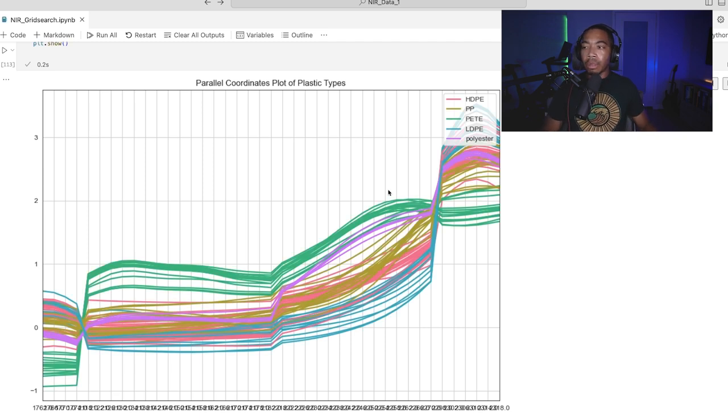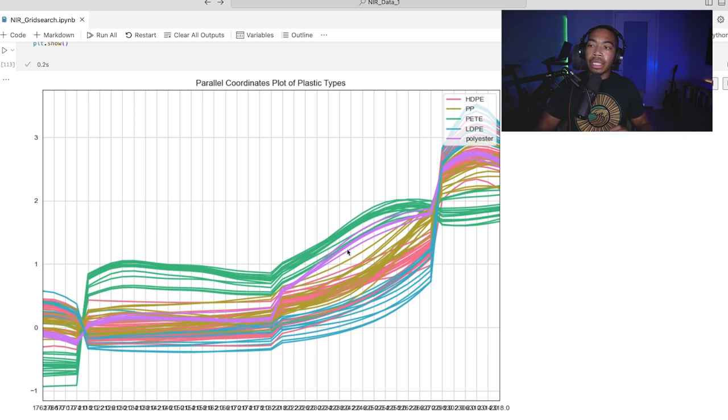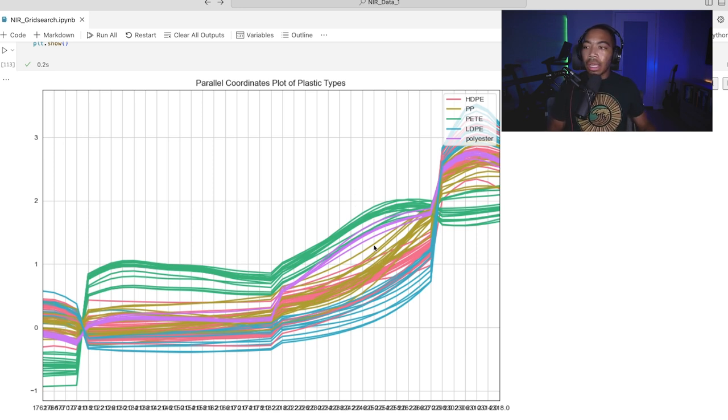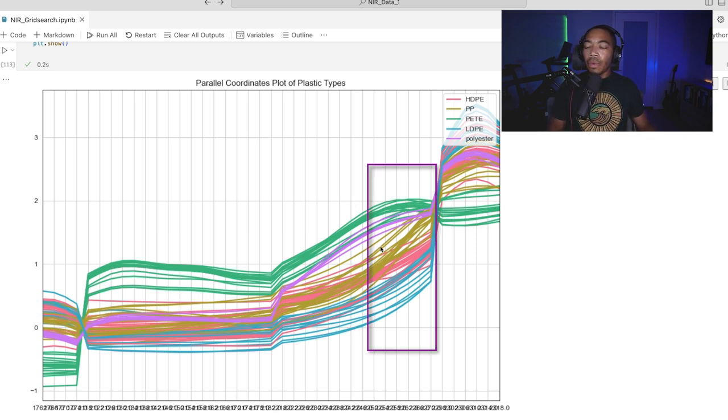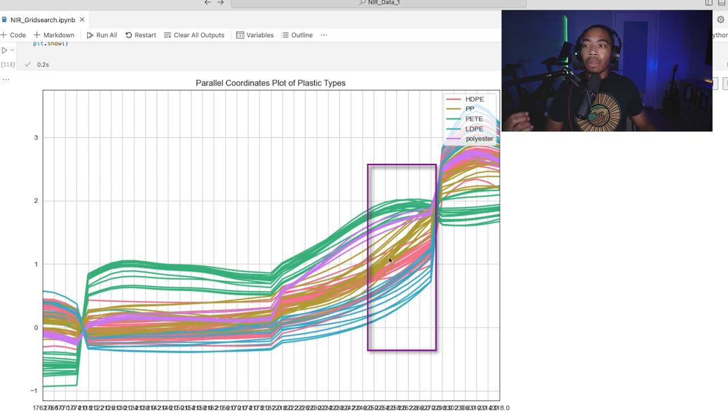You can see at various wavelengths, these vertical bars represent a feature, we can see how the model is attempting to pick these out. For instance, we can see that these features here, we have a lot of separation between all of the plastics.